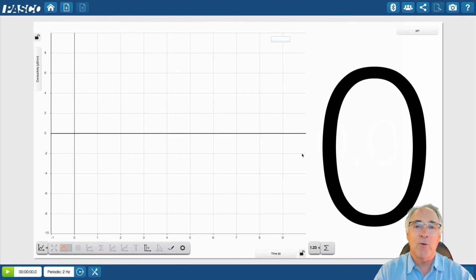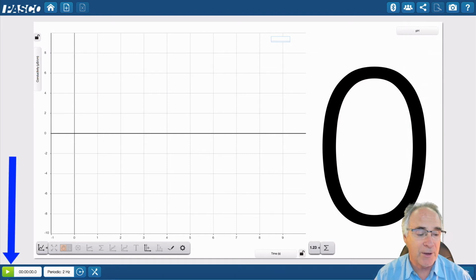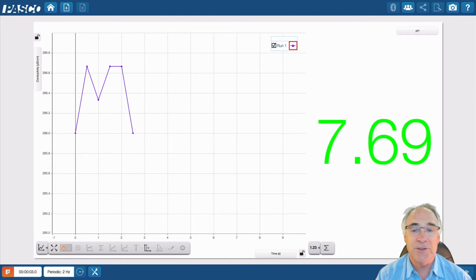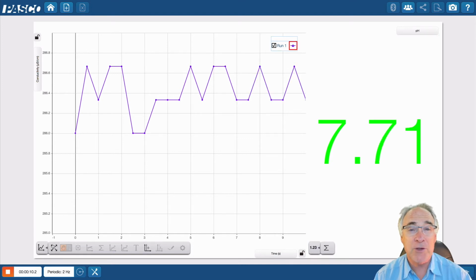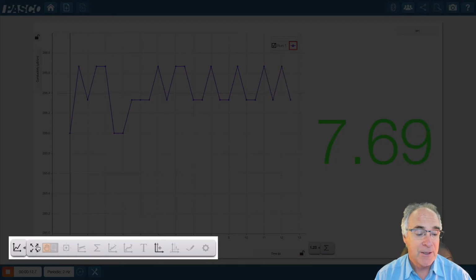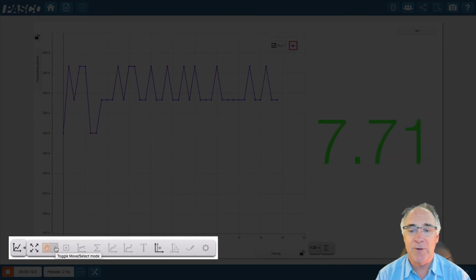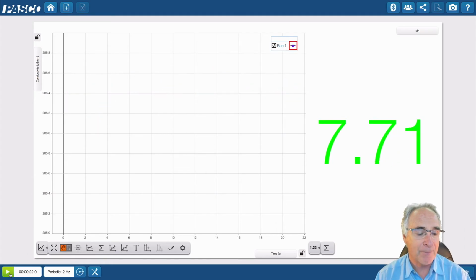And so on one side, I'm going to be collecting the data as it comes in for conductivity, the salt concentration, and of course the pH. To do that, I'm going to click on this green button right here. When I do that, it starts to collect data, and you can see it in real time. And right down here is a really nice feature. For most all of these, the apps and software that we'll be using have some kind of graphing tool, which makes it much easier to deal with. So I'm going to go ahead and hit stop.